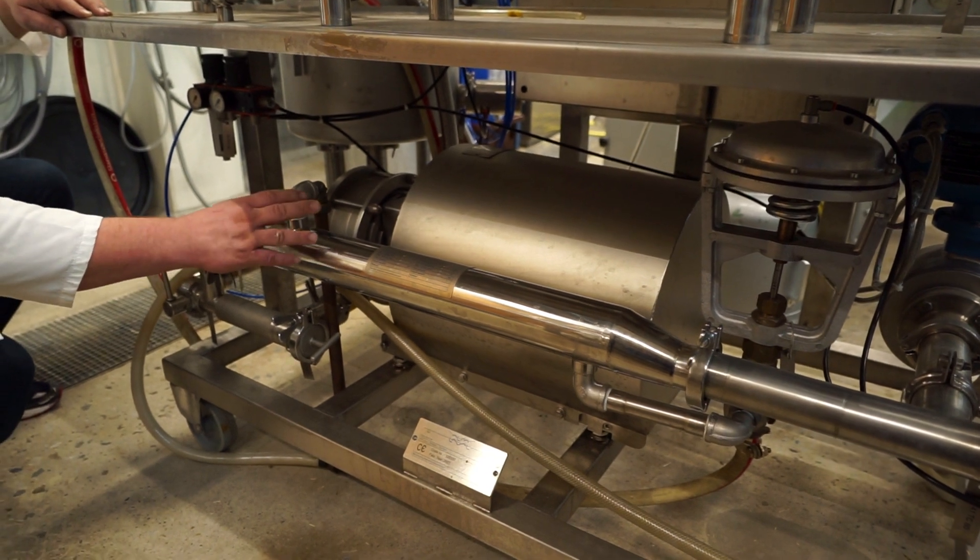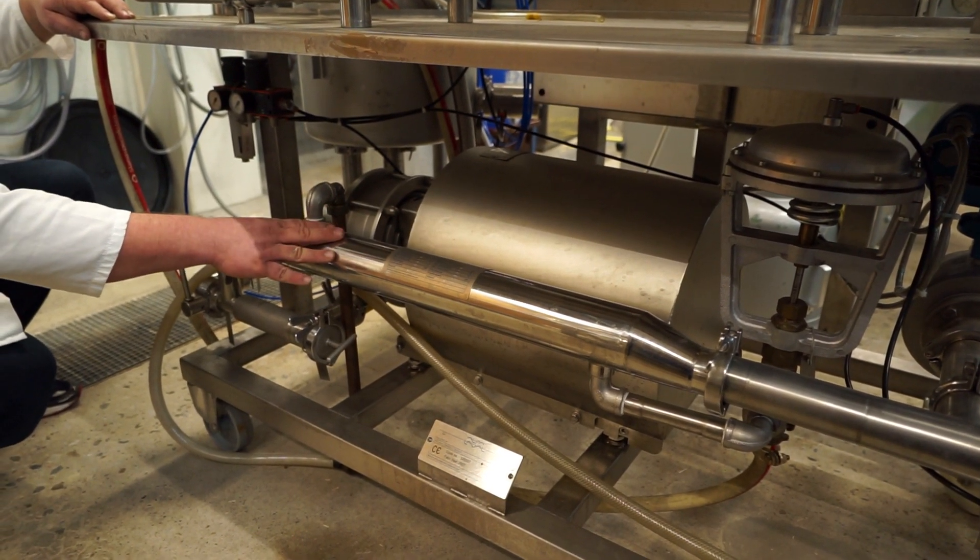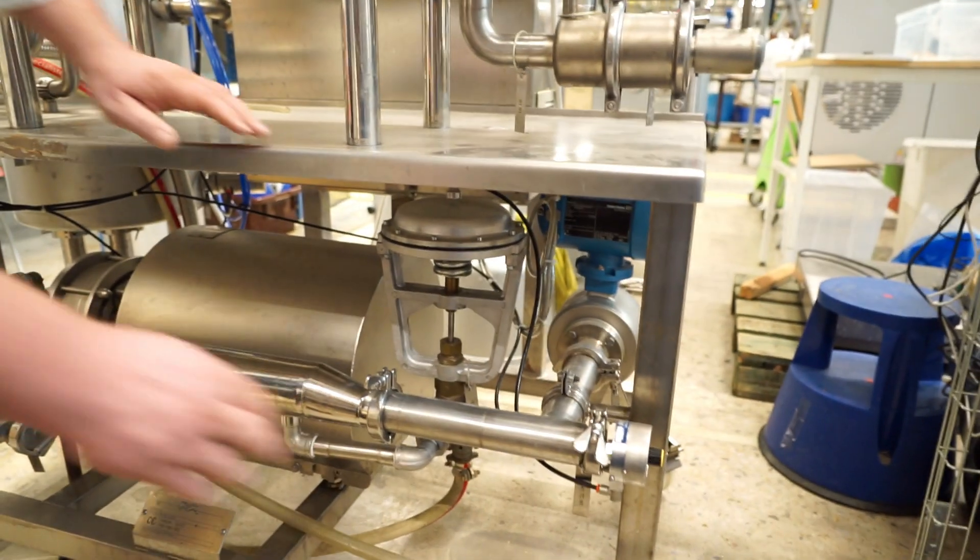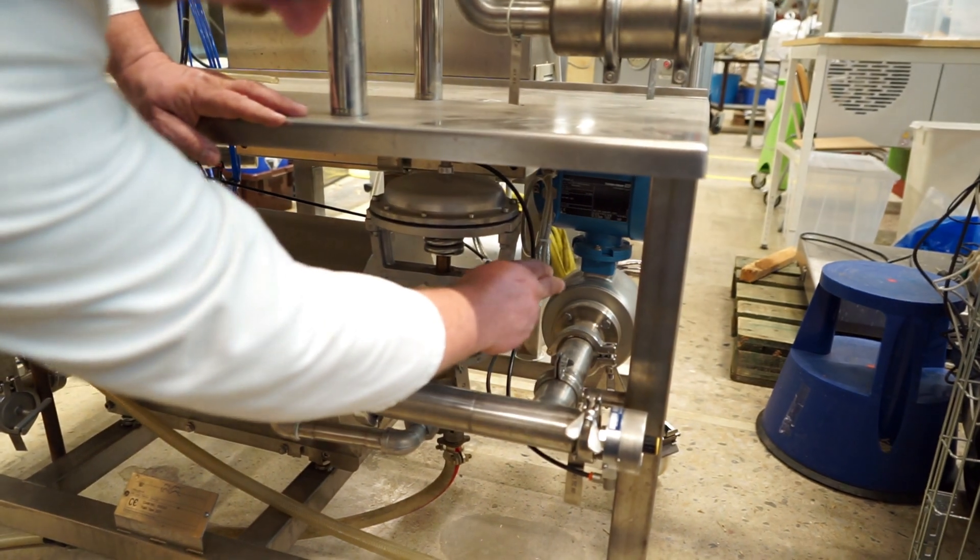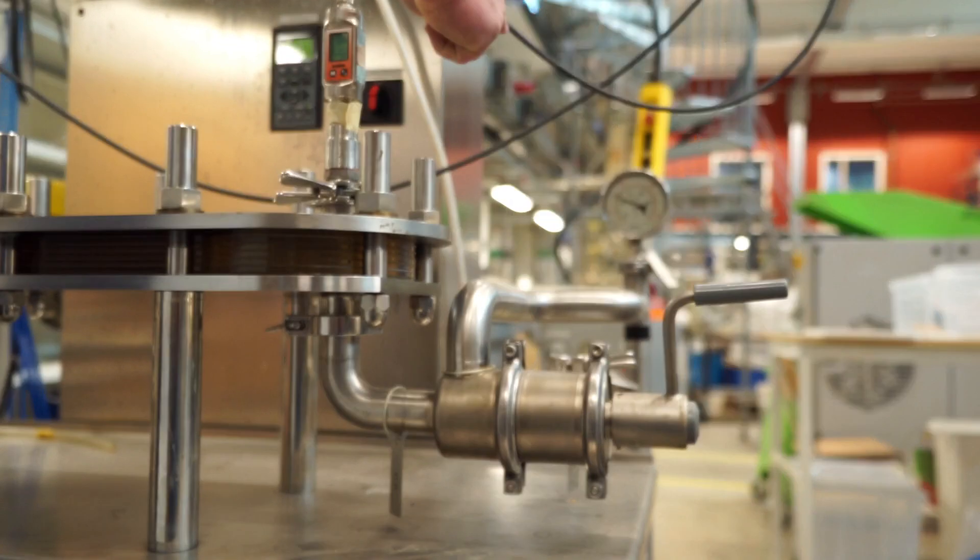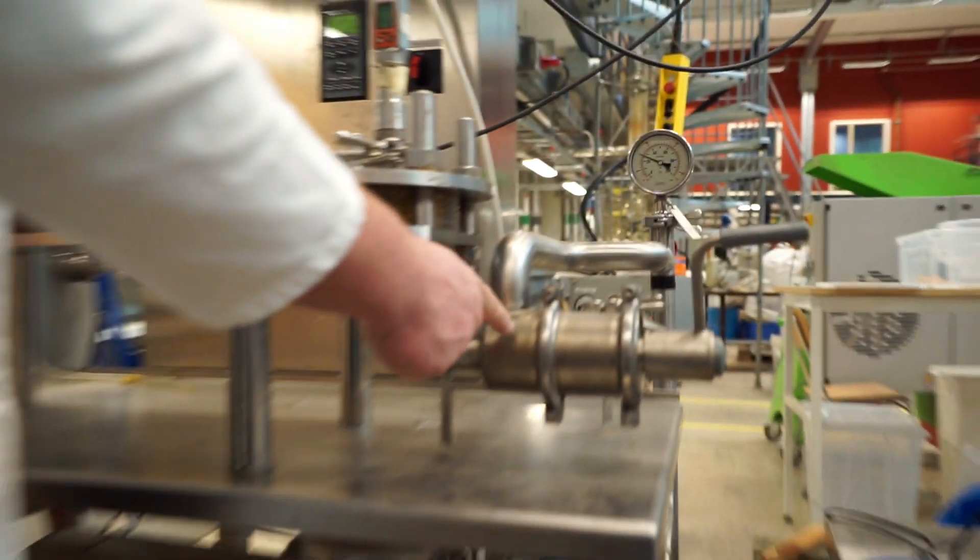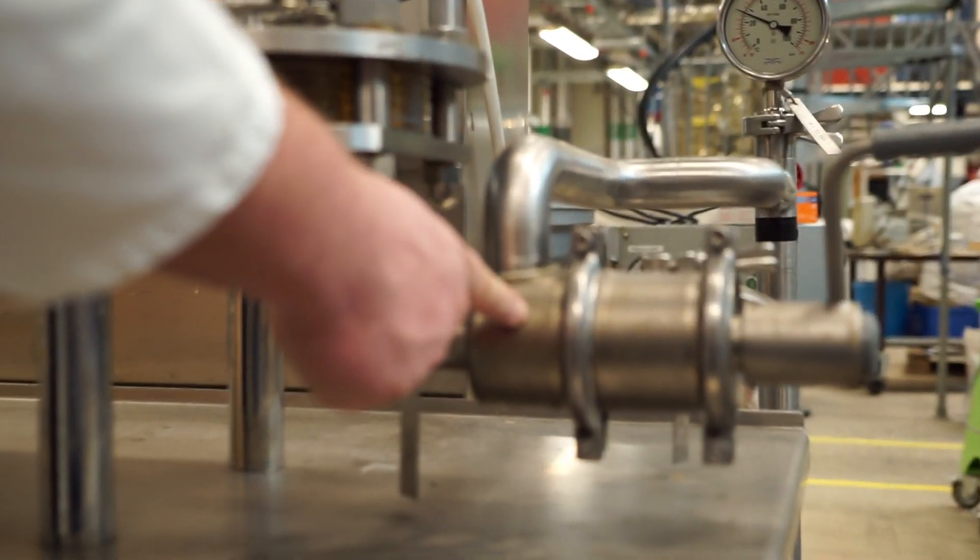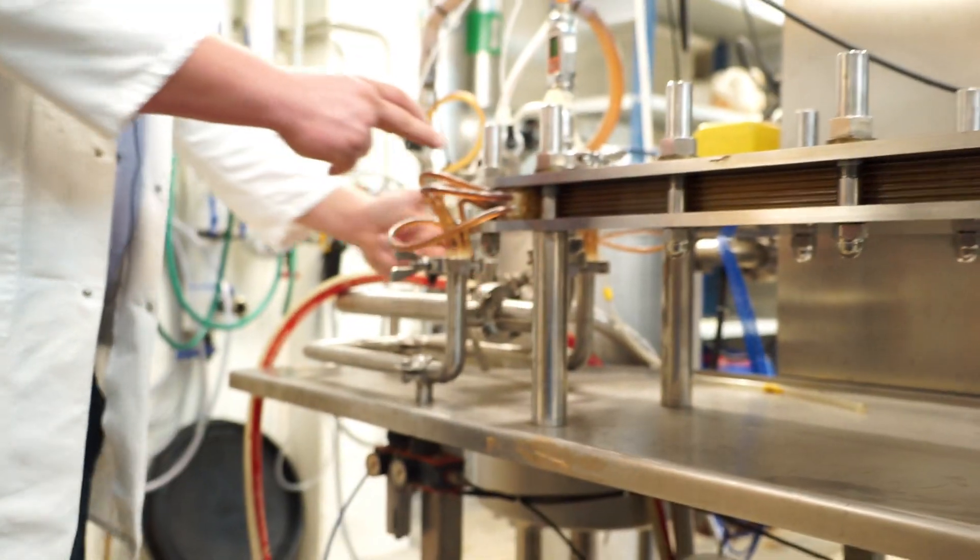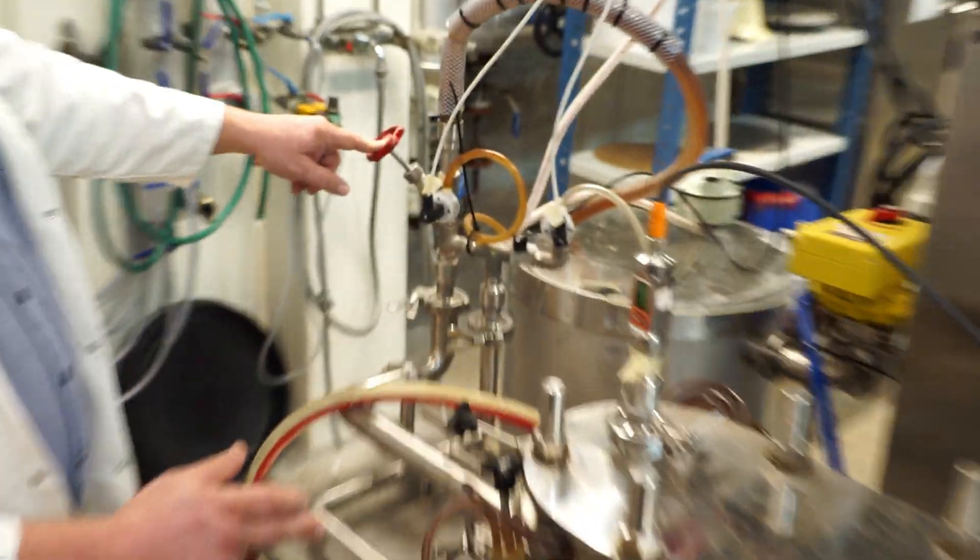Since there's a heat exchanger, we can either use steam or hot water to control here. It goes through a flow meter, comes up until we have a pressure gauge over here. Here we have another valve that we can close off the module with. It goes into the module, through the module, and through a valve that we can use to control the pressure, and back into the feed tank.